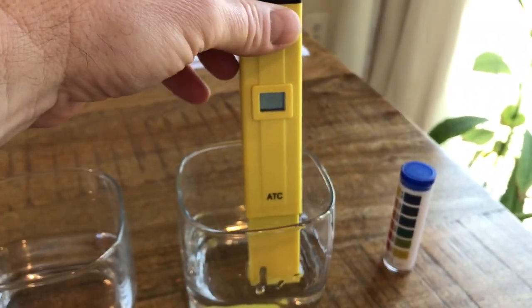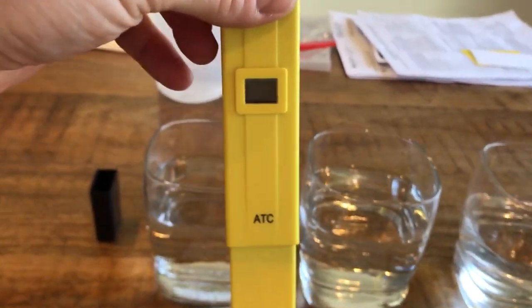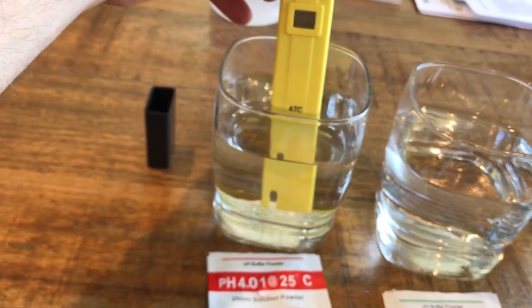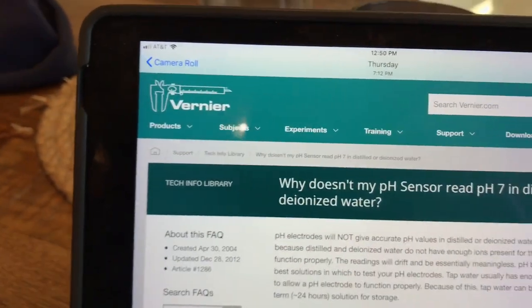I was going back and forth thinking maybe these calibration solutions were off, trying to adjust this up to 7, then sticking it back in the calibration solutions and finding those were wrong. I spent quite some time trying to figure this out and just assumed this thing was junk. But upon some research, I found an article from Vernier.